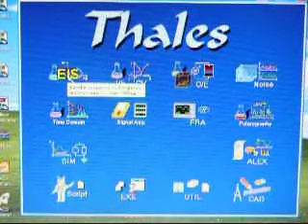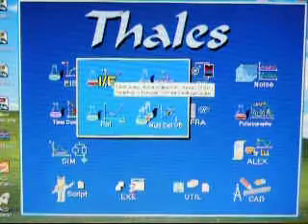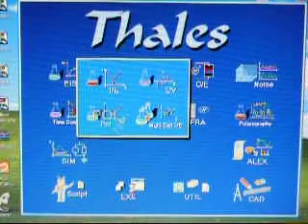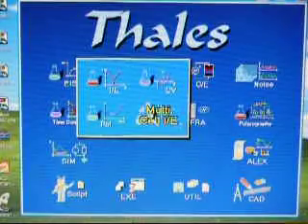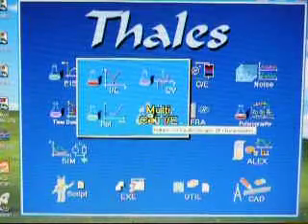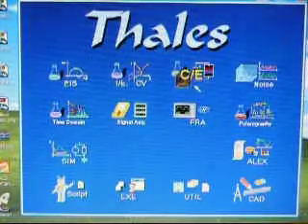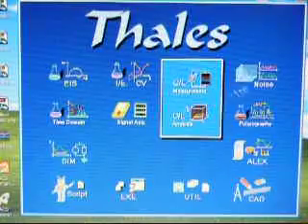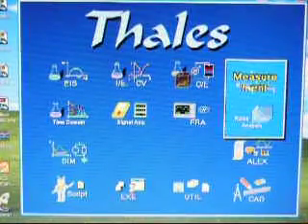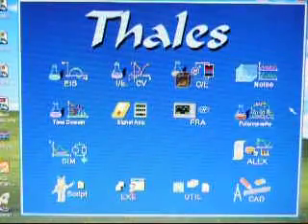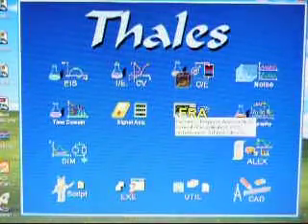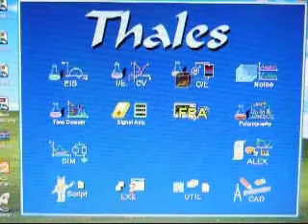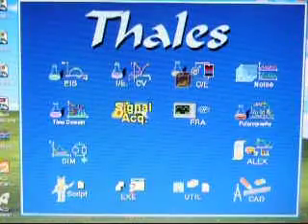Available applications include electrochemical impedance spectroscopy, linear current voltage sweeps, cyclic voltammetry, polarization scans, and multi-cell I over E. We have capacitance measurement and analysis, electrochemical noise, polarography, and FRA where we can run the frequency response analyzer with a third-party item.